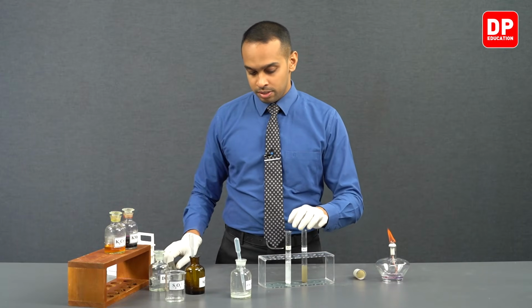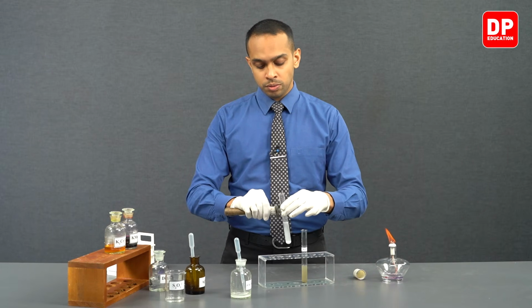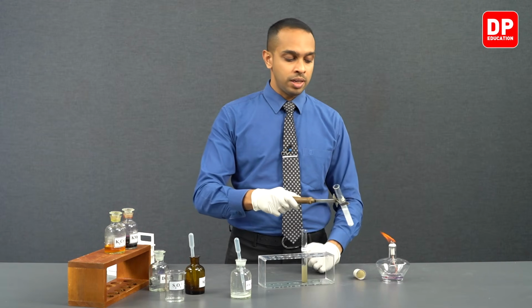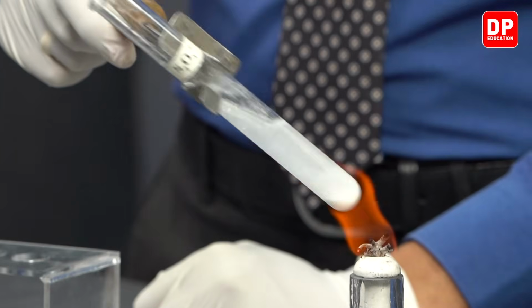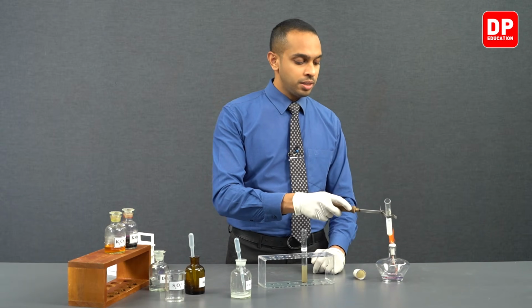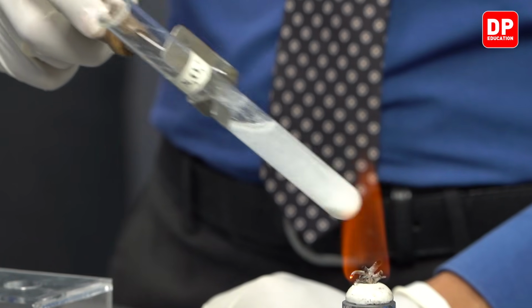Now we have our spirit burner set up here and it is lit. We are now going to heat this lead thiosulfate precipitate and observe the color change. Remember students, we started with a white color precipitate. So let's observe what happens to the white color precipitate here.